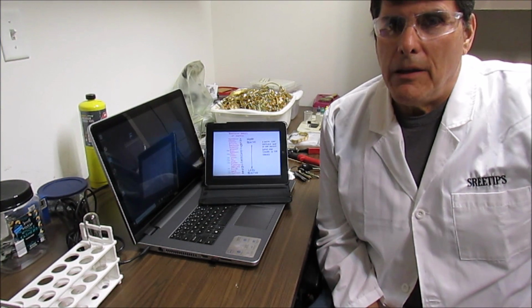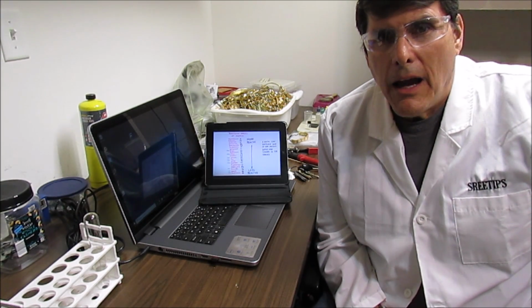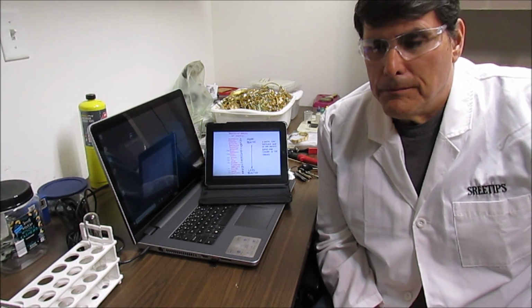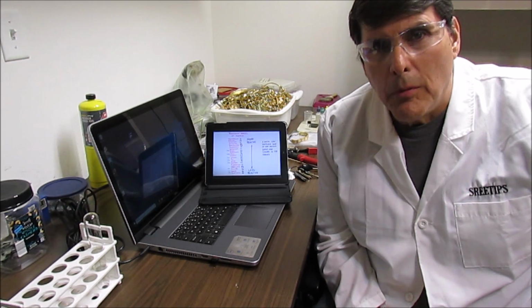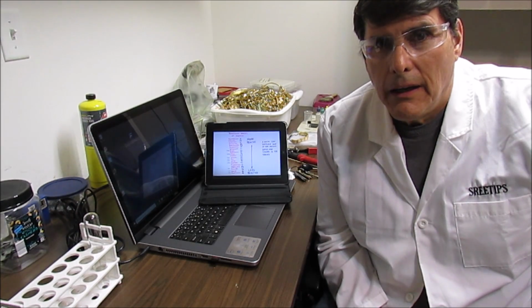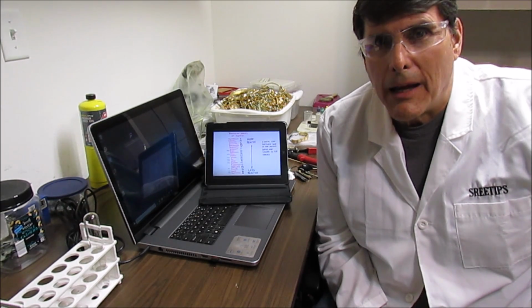I think I'm going to stop the video right here and issue an appeal to my viewers. I am at the same spot I was when I first started. I've got platinum, palladium, and copper in solution, and I'm not sure how to proceed here. What I did last time was I just cemented everything on the zinc and then went from there, and I'm thinking that's probably the way to go here. But as you've seen from the tests that I performed, when I put that solution on that piece of zinc, I got some black powders coming out, but I also had lots of copper precipitating out on the zinc, which is going to contaminate my black powders.